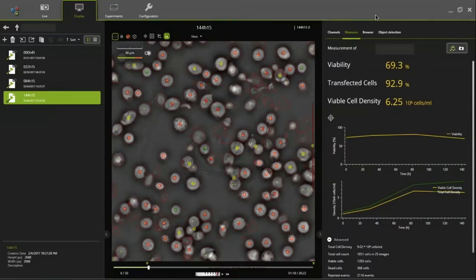There is also a clear difference between the first two runs and the third run, where infection happened later. Here you can see how the software looks in the mode where you monitor infected cells — on top of viable cell density and viability, you get a number for the percentage of infected cells and automatically get the graph indicating how the infection is progressing.